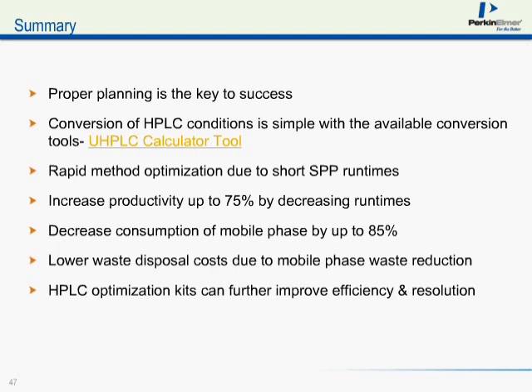Well, that is true, but because when you optimize your system and you go to the narrower ID tubing and the lower volume flow cell, your peaks become sharper and taller, and so really it kind of washes out. And if you look at these two chromatograms, you get pretty much the same sensitivity between the two, and the reason is the height and the sharpness of the peaks.